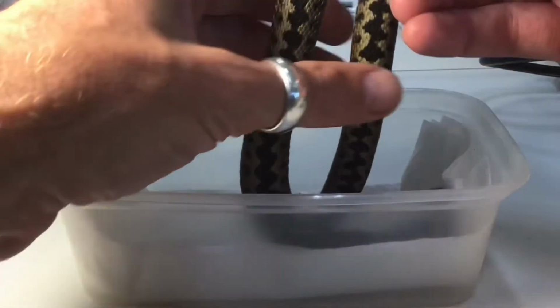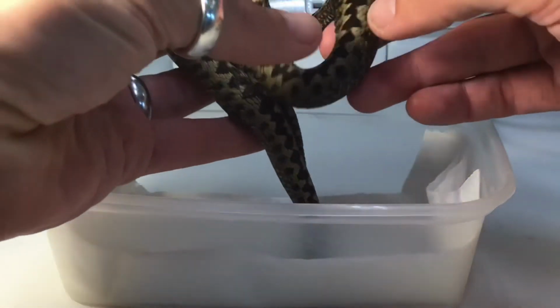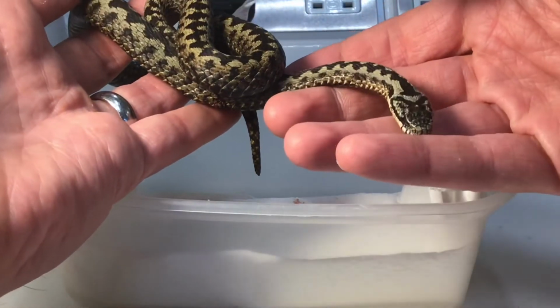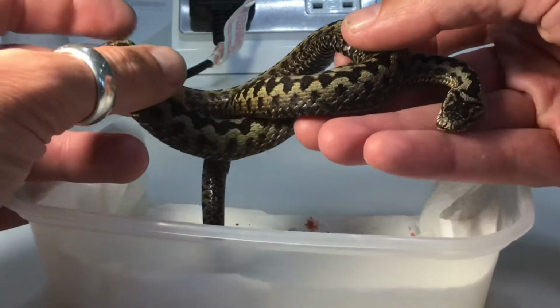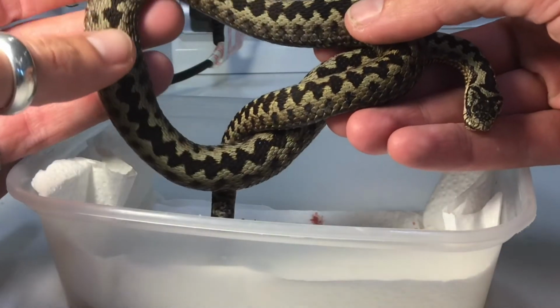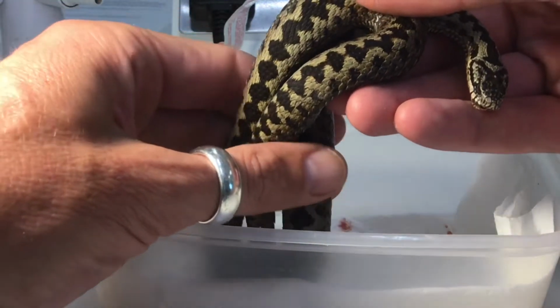As I say, unfortunately this chap had been squashed, run over by a car, but this is a very well preserved specimen, apart from the injury sustained by the vehicle. It's a male snake, and he's got a sort of puncture wound, but it's very, very supple, very, very smooth and dry, and a beautiful specimen.